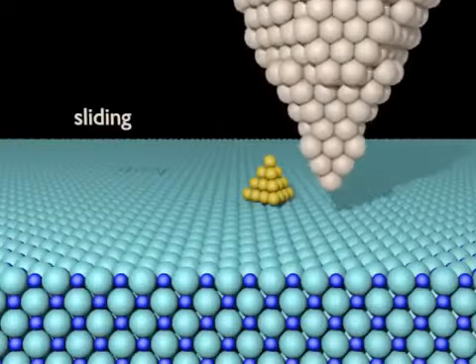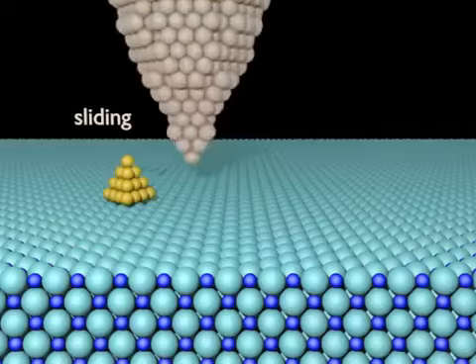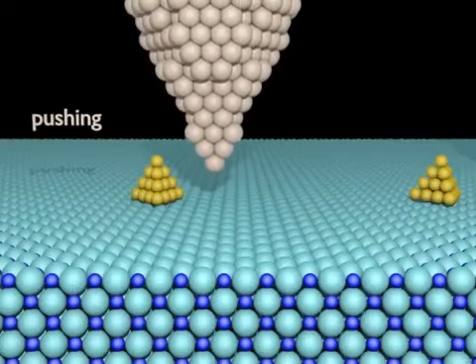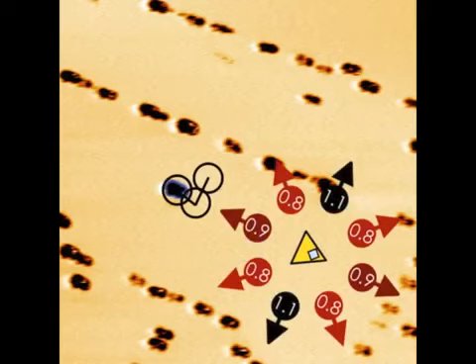To see if this is truly the case, we manipulated clusters in different ways, by scanning with the tip laterally and by pushing down vertically. Here we see a series of images taken between manipulation steps for a cluster found on a terrace. As expected, the cluster can be moved in any direction.